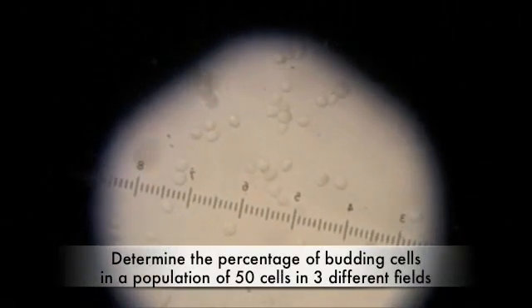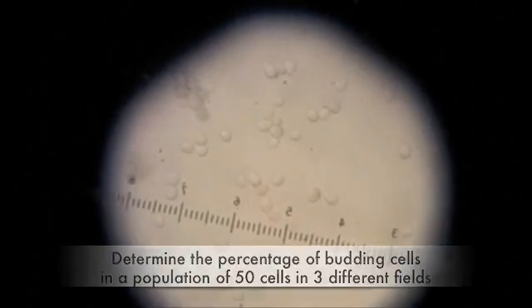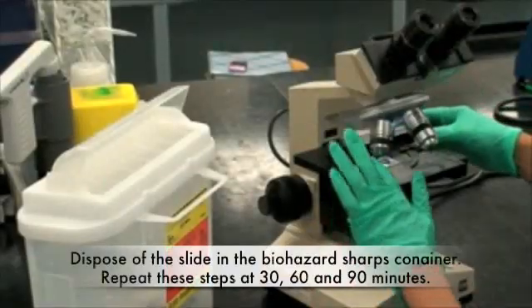Determine the percentage of budding cells in a population of approximately 50 cells in 3 different fields.